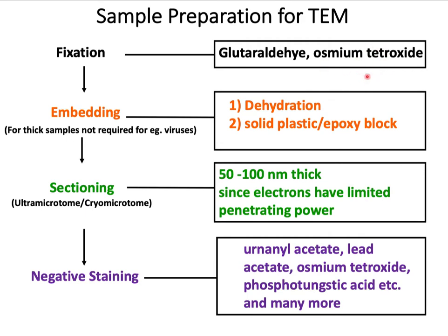It is very important because it binds and stabilizes the lipid bilayer, which is very important in TEM because when you section, you use much thinner layers than light microscopy. But the osmium tetroxide is also electron dense and it serves as a stain, which I will discuss shortly.